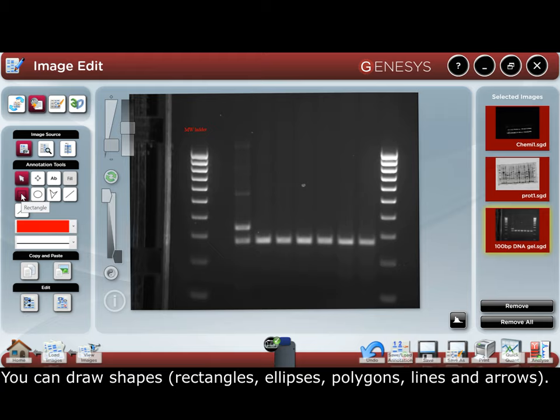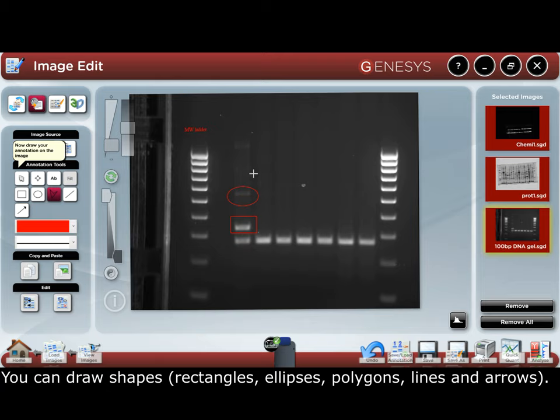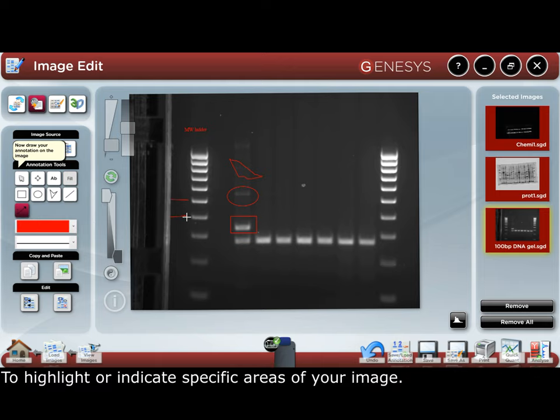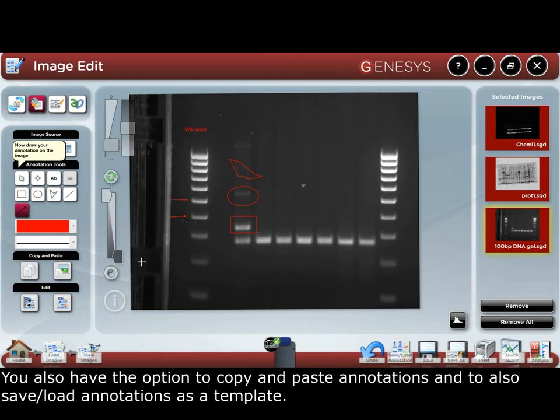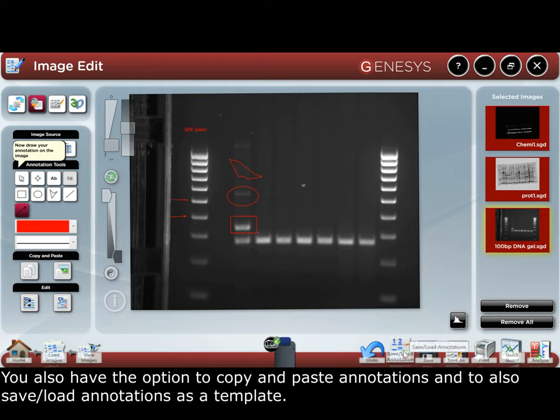You can draw shapes — rectangles, ellipses, a polygon, lines, and arrows — to highlight or indicate specific areas of your image. You can also copy and paste annotations, and save and load annotations as a template.